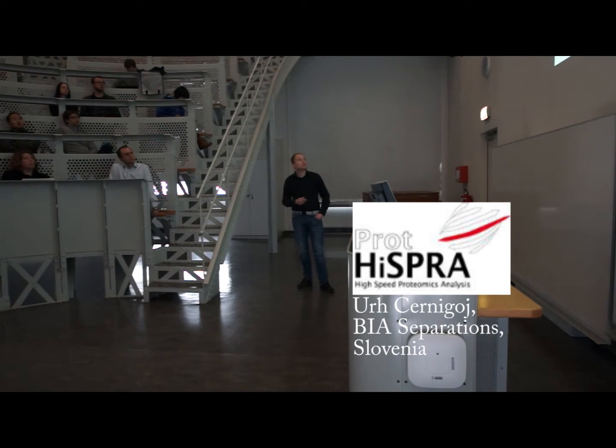And the last characterization method used was diffractograms. So this is the classical rutile diffractogram having this diffraction pattern, and you can see that even on the monolith you keep this diffraction pattern, while on the bare monolith there is no diffraction pattern. So it means that really it was a successful adsorption.